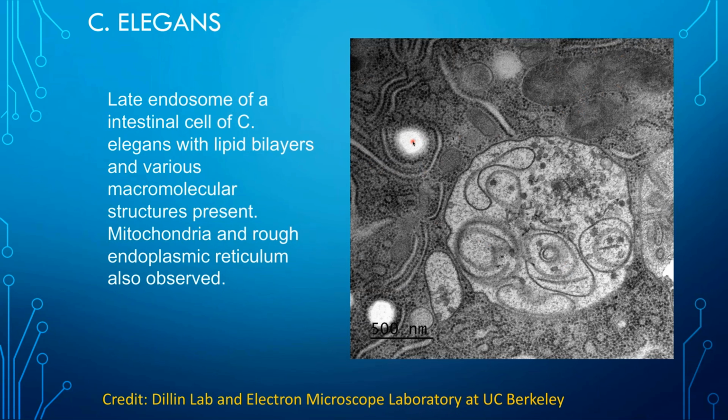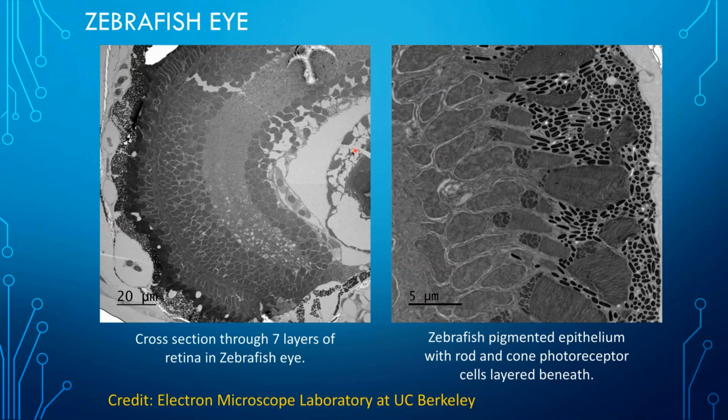So we generally found that the Rio was really versatile, really capable of doing wide field imaging as well as our high resolution imaging. And just to give you an example of the large scale stuff, here's zebrafish that was preserved to look at the eye structure as well as the brain structure. And you can see along this edge here, and I'll try to move my mouse slowly so you can track that, this is the outside edge of the zebrafish eye. And as you travel inward towards the middle, here you're going to go through the layers of the retina.